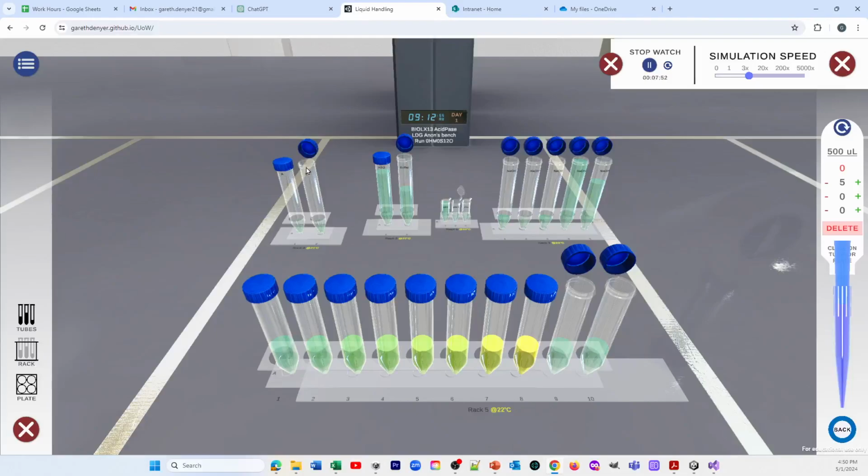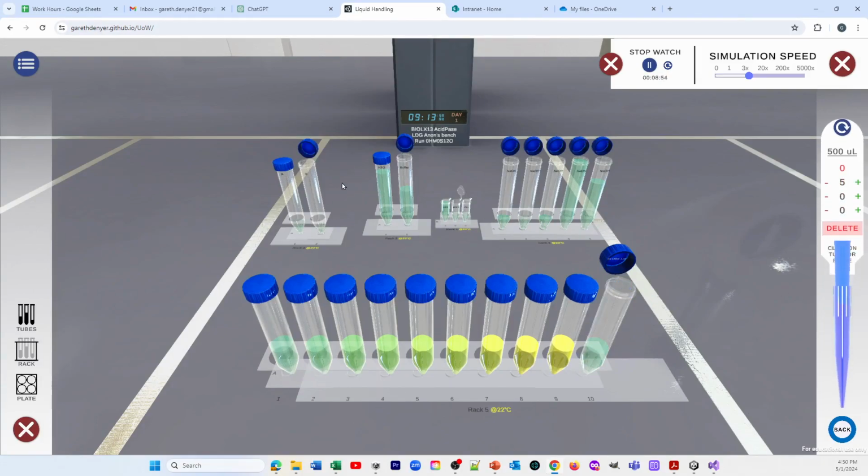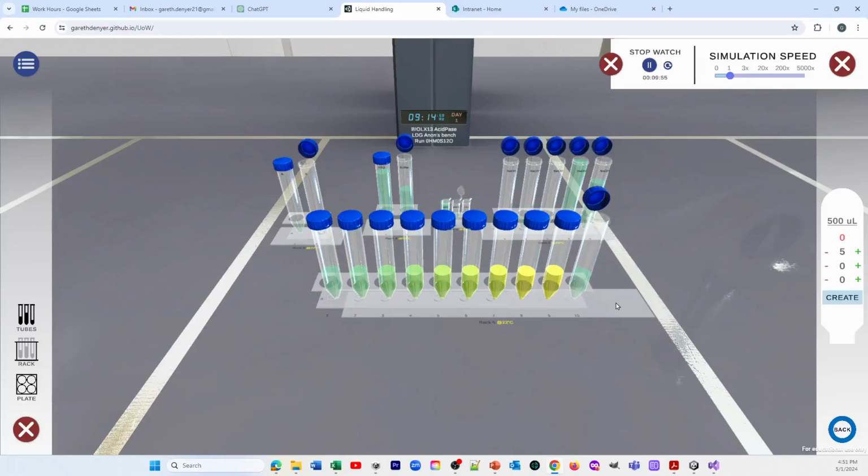sample. And actually we're getting pretty close to using up all of that solution, aren't we? Almost all going to disappear. In fact, I think it might even disappear on this last one. Let's see what happens. So we suck up. I don't think that's actually the full amount in there. So you know what? I'm not even going to add it.